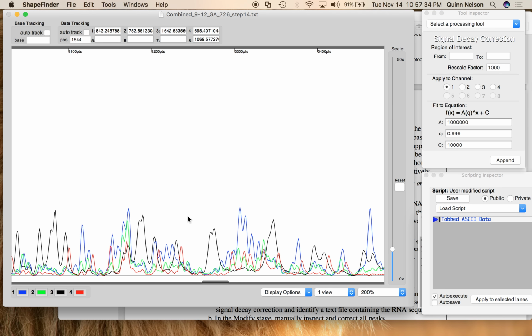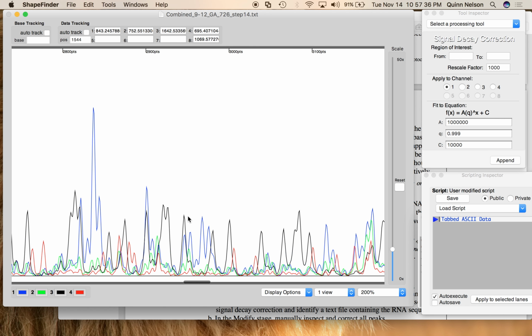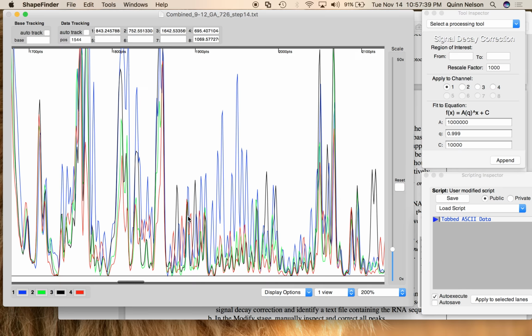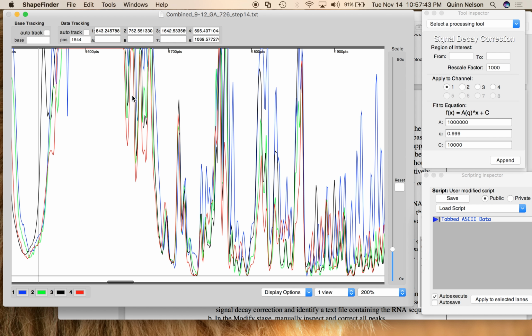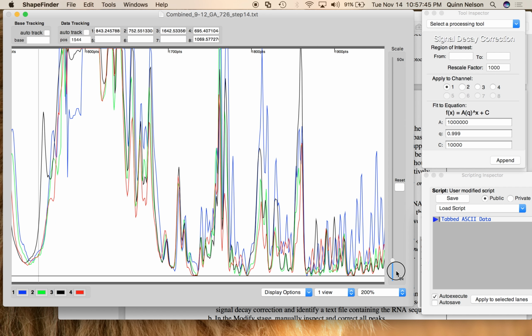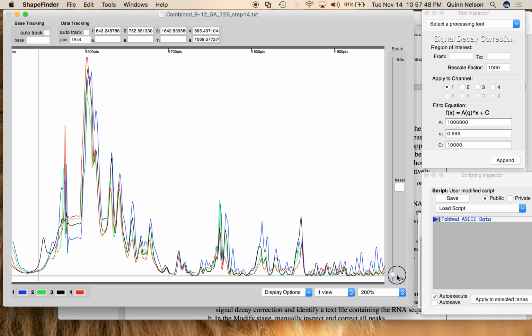All right, let's find a good region of interest. That's the next point of matter. Okay, so we are going to start probably after these big peaks, okay? I like finding this region right here. You get these big peaks, and then you kind of die off a little bit, have a little hump, and then you start. I feel like that is the start of some good data.